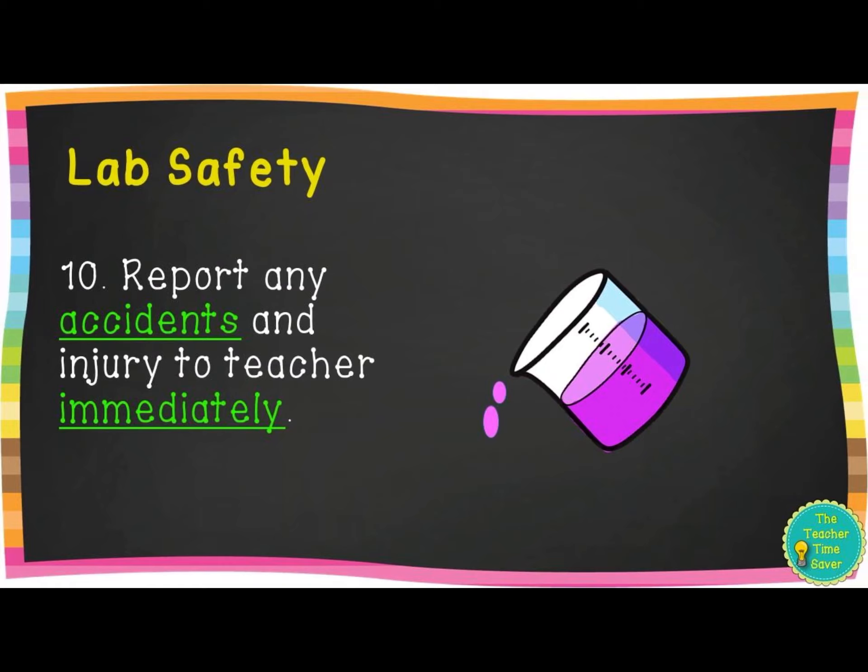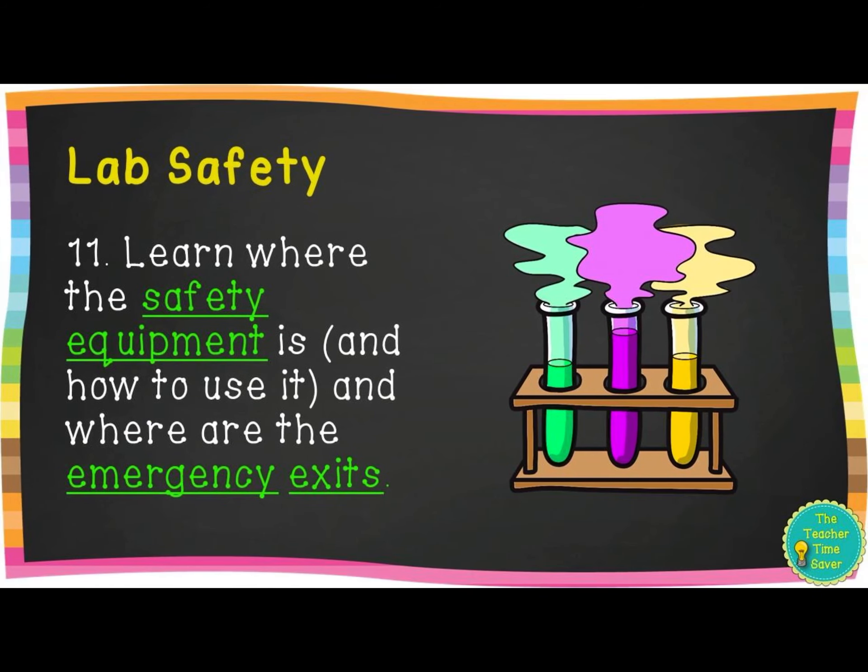Number ten: report any accidents and injuries to the teacher immediately. If you spill something or accidentally affect someone else's project, just let me know right away — it's easier to clean up if you tell me immediately. Number eleven: learn where the safety equipment is, how to use it, and where the emergency exits are. Some chemistry labs have an eye-wash station where, if you get chemicals in your eyes, you hold your eyelids open and it sprays water into your eyes for around 20 minutes. Now is a good time to learn these things while we're doing something a little less scary.